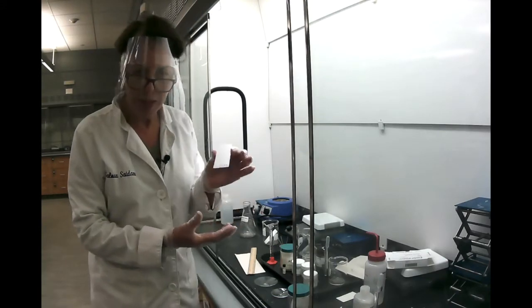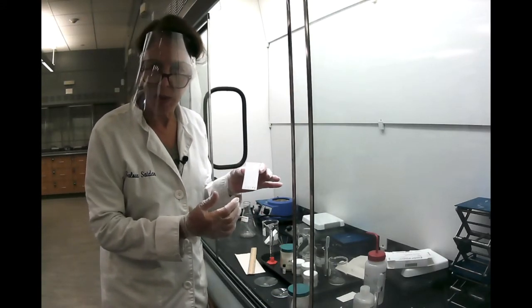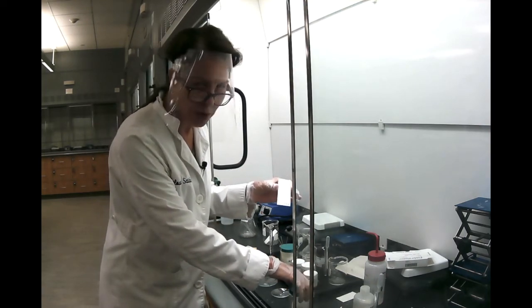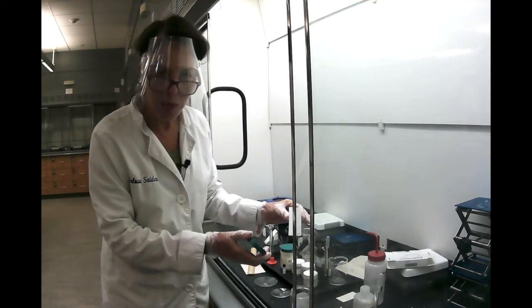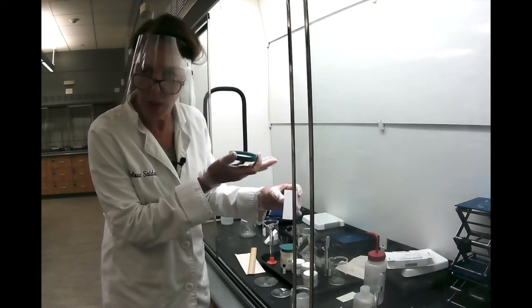So now we're ready. We checked it, and we have enough substances on our plate. We spotted enough substance, so now we're ready for the jar, the developing jar. The key thing again is you want the liquid to move slowly without disturbance. You want all of it to move at the same pace.